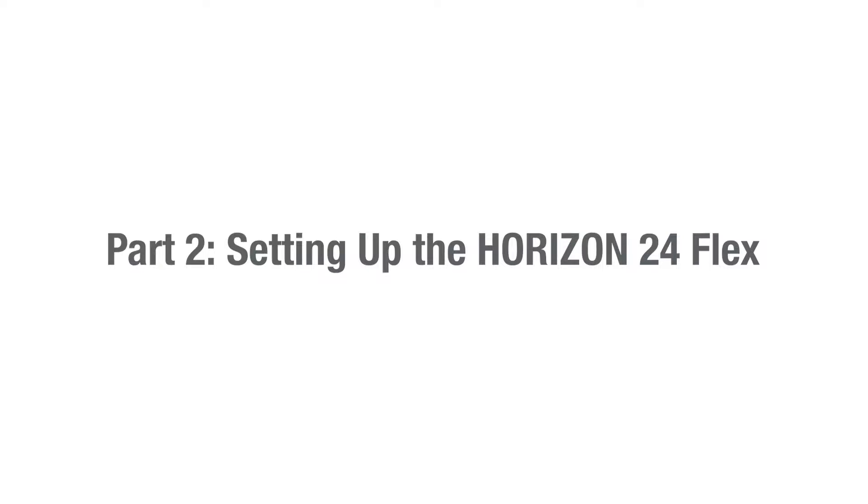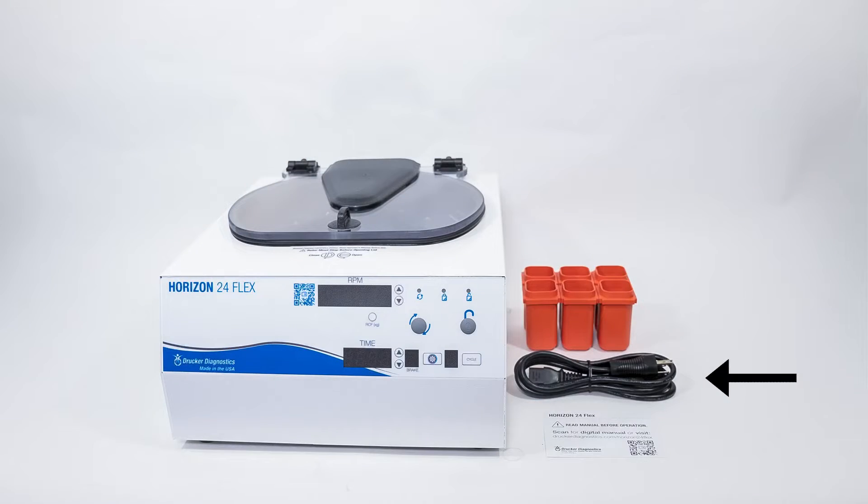Part 2: setting up the Horizon 24-Flex. Let's start by making sure we have all our necessary accessories. These came out of your accessory kit, the small box packed on top of your centrifuge. You'll need your power cord, your tube holders, your quick start insert, and your centrifuge. If you're missing anything, please contact Drucker Diagnostics.